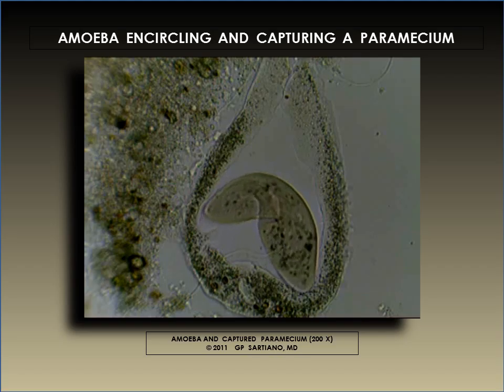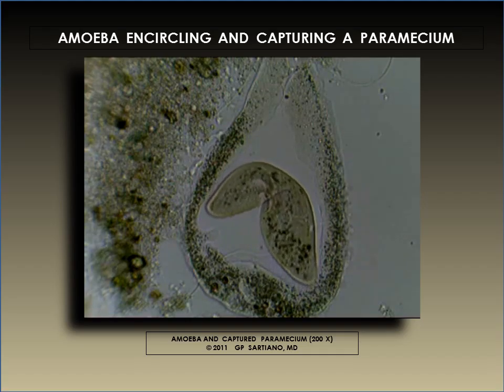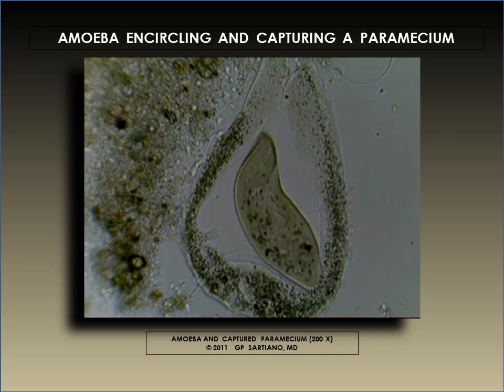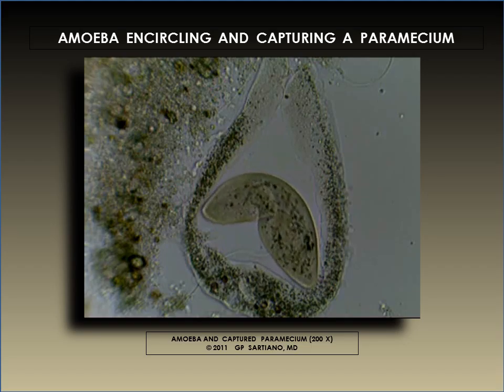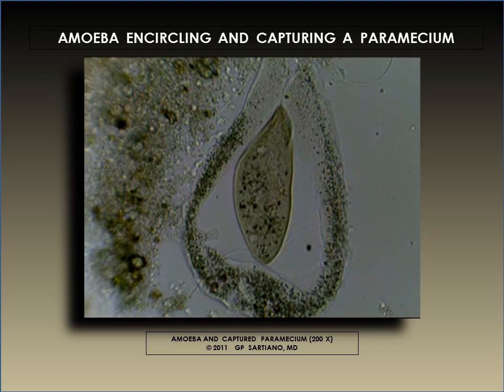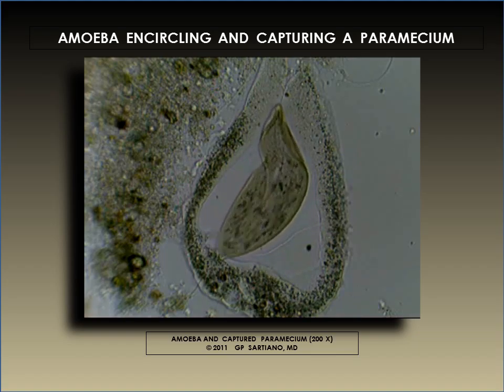Note how flexible the paramecium is. At times it seems to bend portions of its body at right angles without any evidence of breakage of the cell membrane. Note that the paramecium is constantly, almost frantically, trying its surroundings and seeking an exit route. It is already somewhat flattened, probably by cover glass pressure.